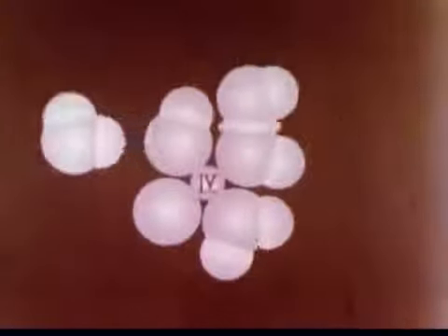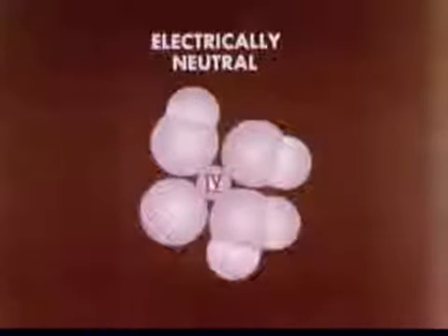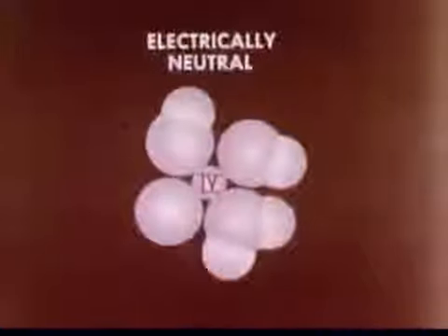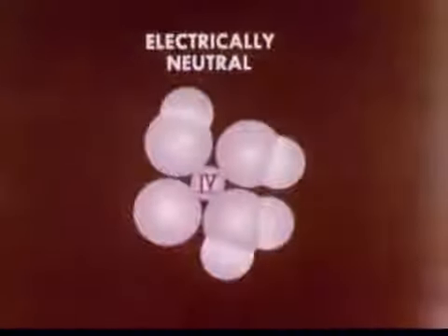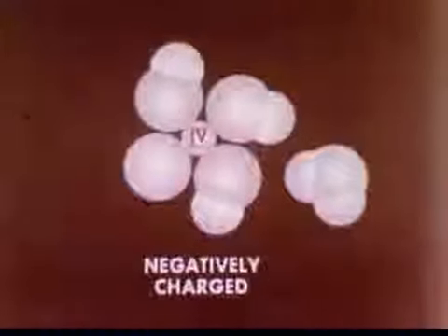As hydroxide ions are added, they remove additional protons and form electrically neutral aggregates. The neutral species precipitates, just as with vanadium 3. However, in contrast to vanadium 3, the hydrogen ions here are so strongly repelled that additional hydroxide can react, leaving negatively charged species which go into solution.